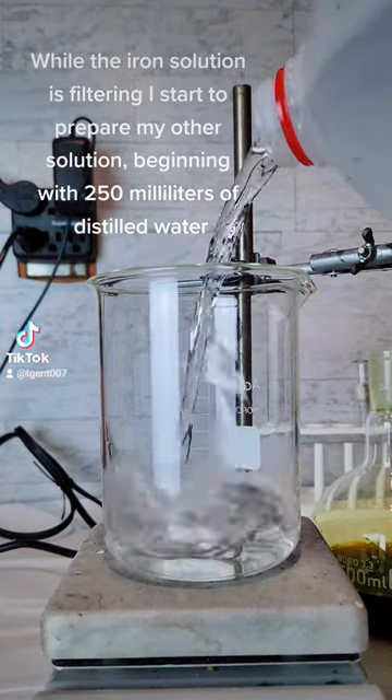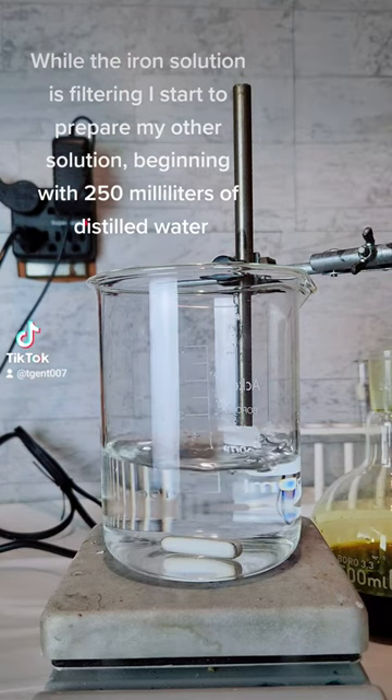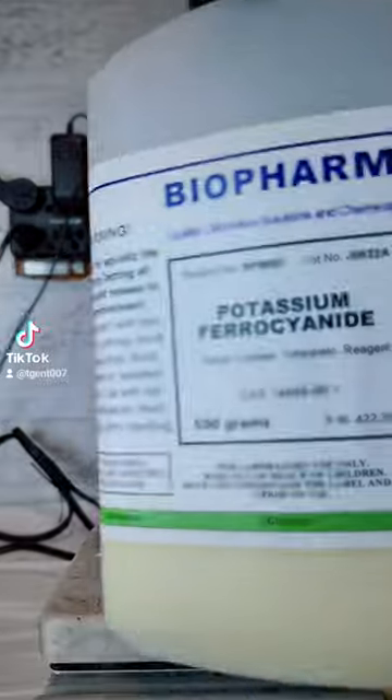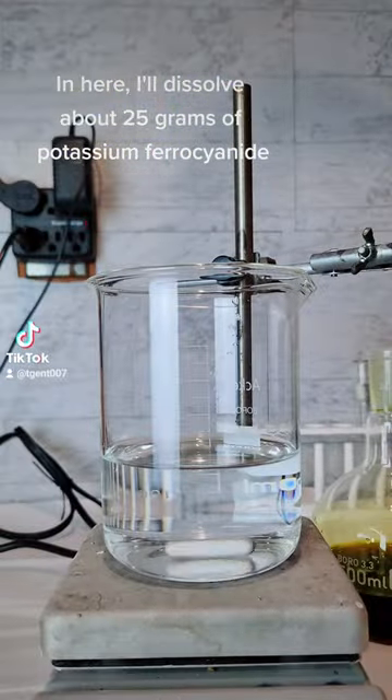While the iron solution is filtering I start to prepare my other solution, beginning with 250 milliliters of distilled water. Then here I'll dissolve about 25 grams of potassium ferrocyanide.